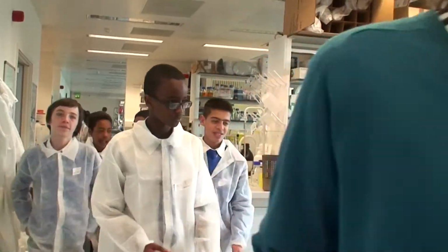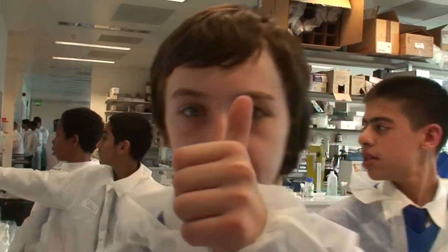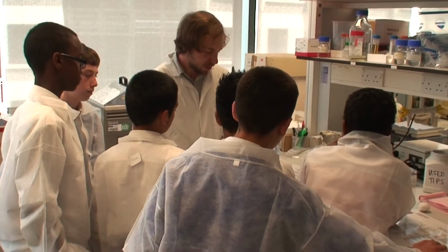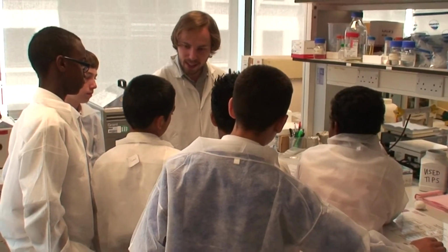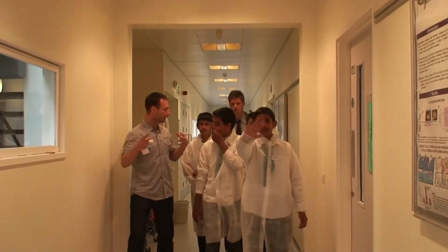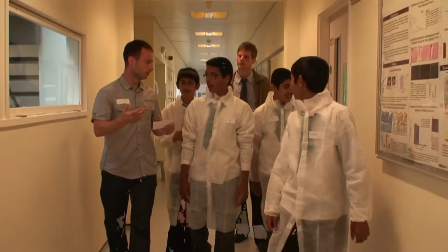Go on, guys. So what I'm going to show you today is the inside of a breast and what it looks like. There's one there that's got a blue and a red, and that's a mutation within the DNA. It's very important the states where these neurons are growing, and it's illustrated here. And that's what I'm studying. The cells in your bone make a very hard matrix to surround.